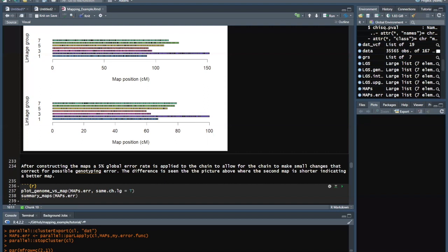Thank you. Cesar has 2 questions, or he might be typing them out. Cesar, can you hear us? It says, with this parallel function, I will change the object LGS.